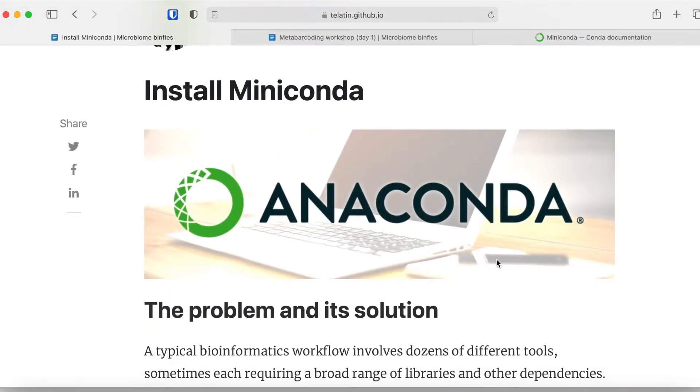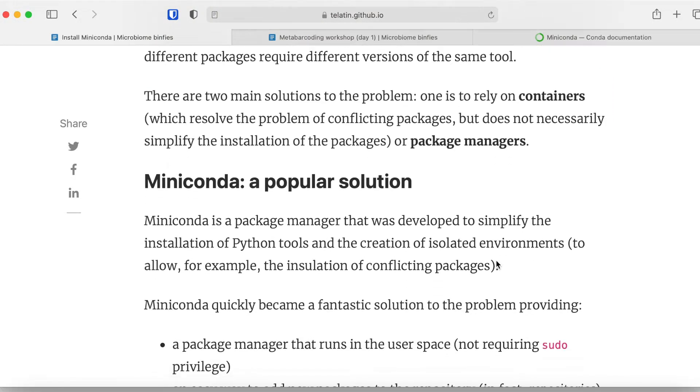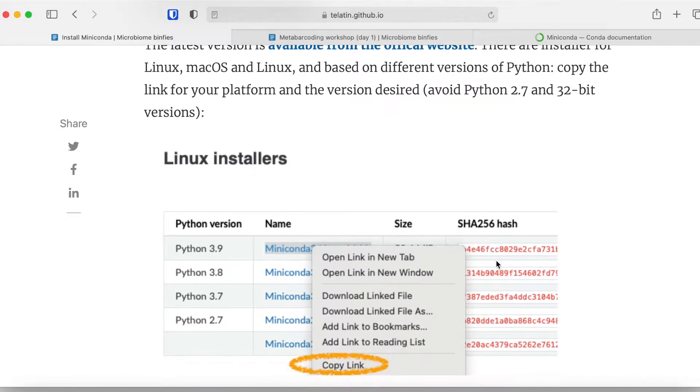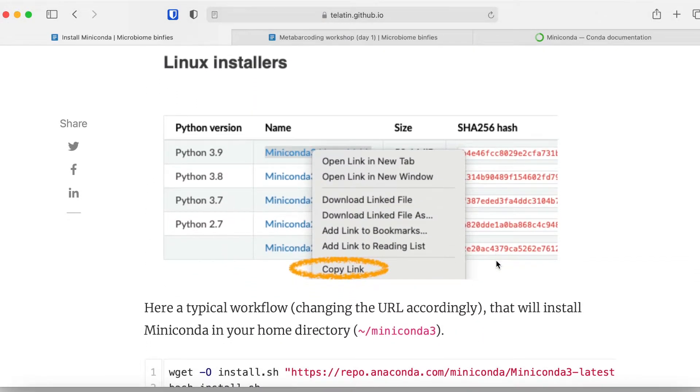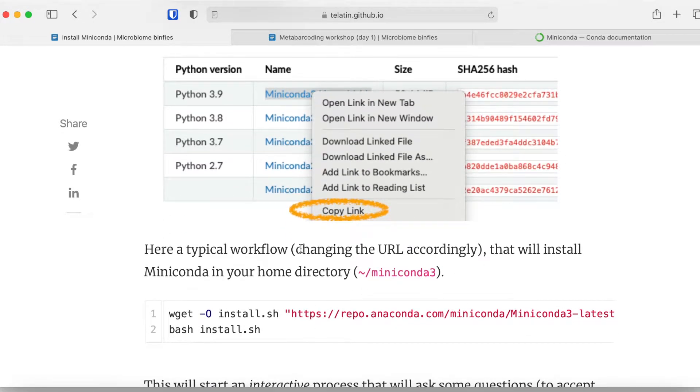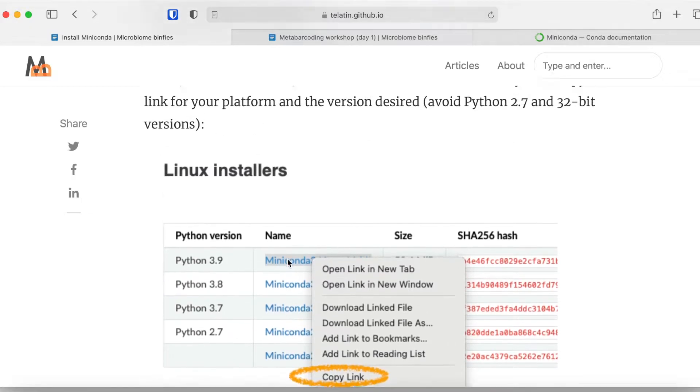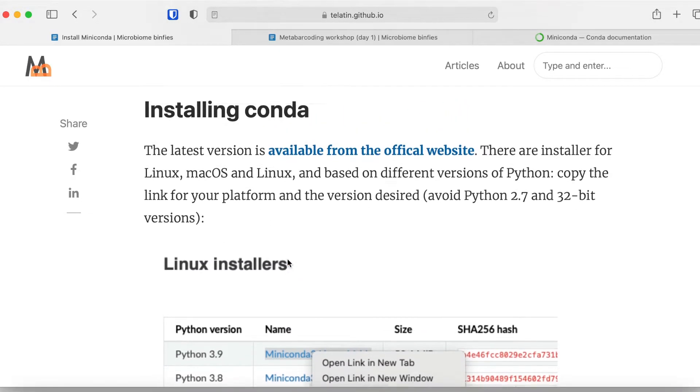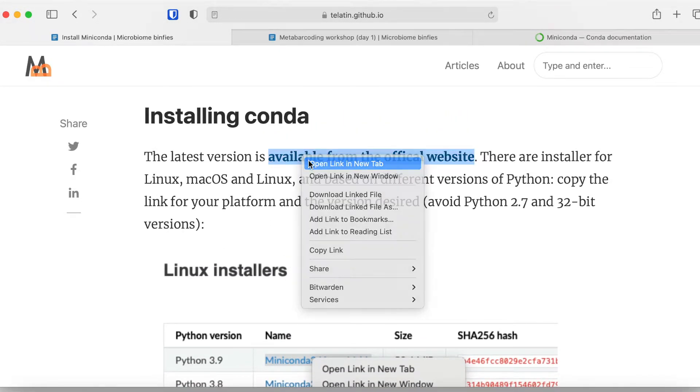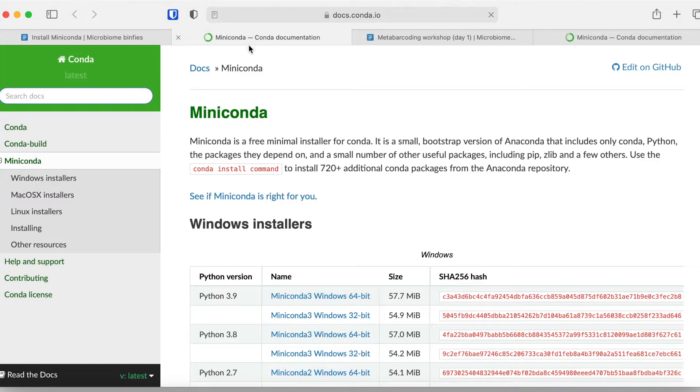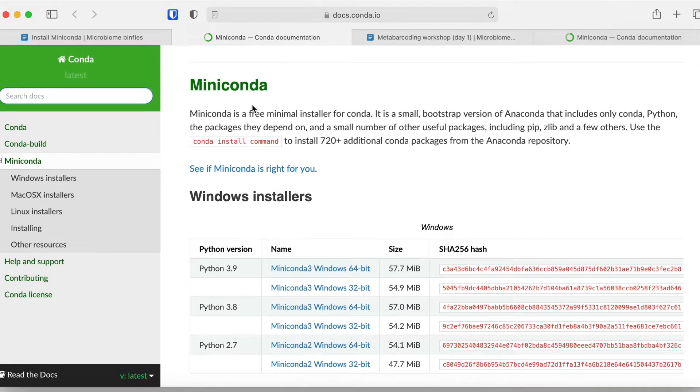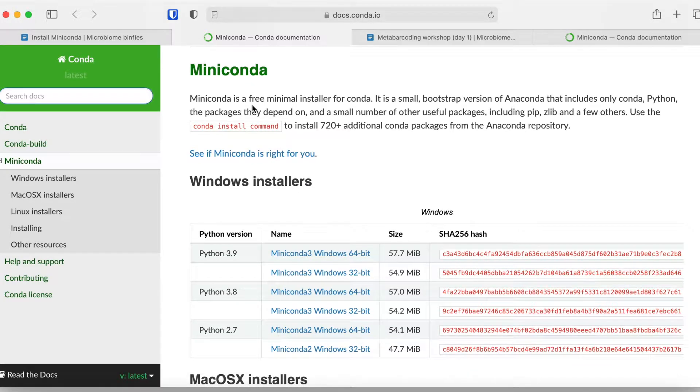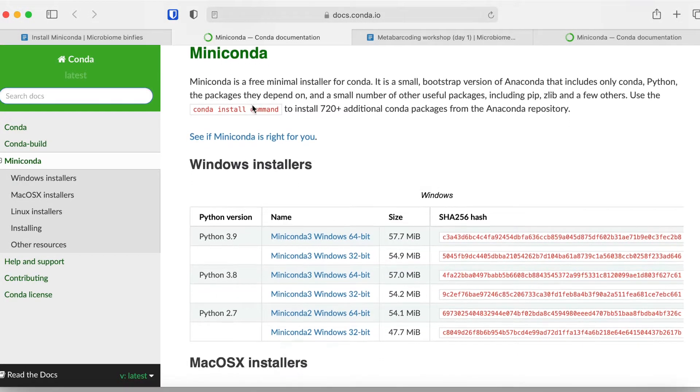We will use Miniconda in quite an advanced way because QIIME 2 does it. You will find some information here and also the instructions to install Miniconda on your computer. The commands you can either copy and paste or you can just go to the official website. Note that there are installers for every operating system and platform that you need.